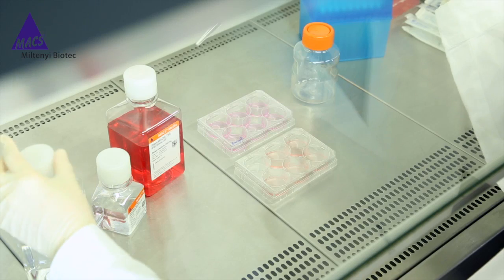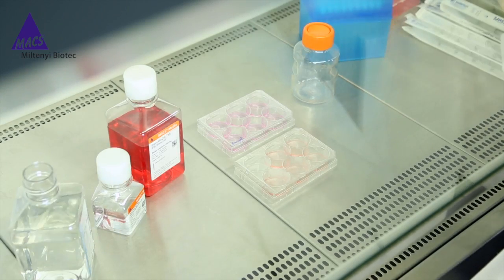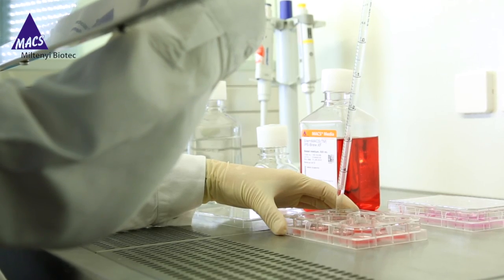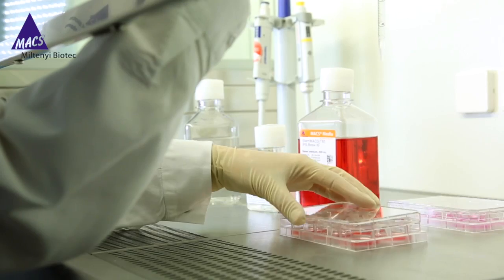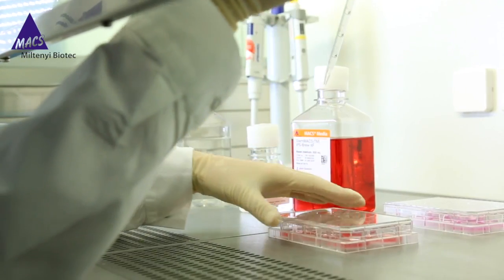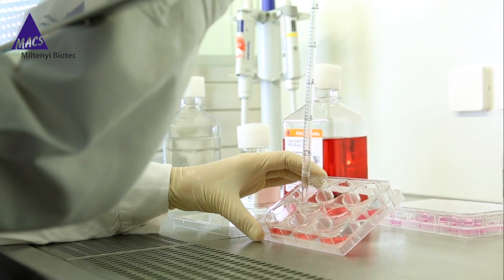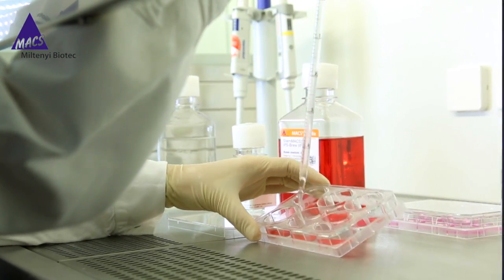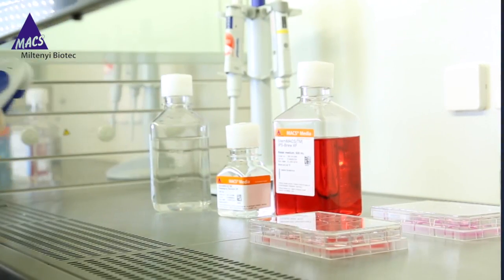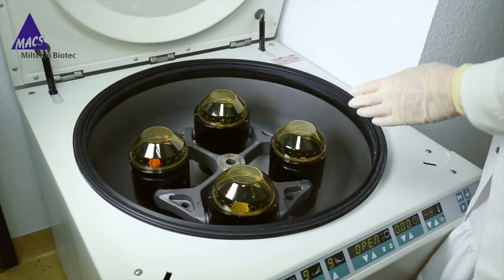The second method is to enzymatically passage single cells after dissociating the colonies with TrypLE or Accutase. A rock inhibitor such as thiazovibin also needs to be applied in order to avoid cell apoptosis. This method results in high expansion rates since single cells are seeded. However, the handling time is still relatively long and overall the whole method is more stressful to the cells. Therefore, this is not the first choice for regular cell splitting.